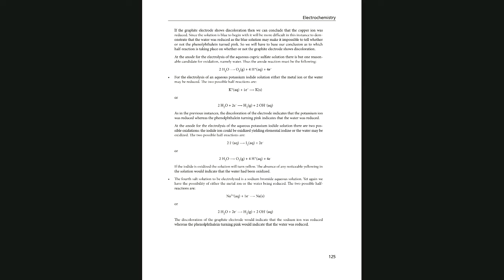Very similarly, you are going to look for evidence of the reaction. If the OH minus has been produced, then you could say this is going to be it. If OH is not produced, then you would say this one. I'm not going to say which one. You have to figure out from the evidence for the reaction. Then for the anode side, between these two, which one is going to be the reaction? So if water is again reduced, then most likely iodide is going to be oxidized. And if the other one, then water is going to be oxidized.